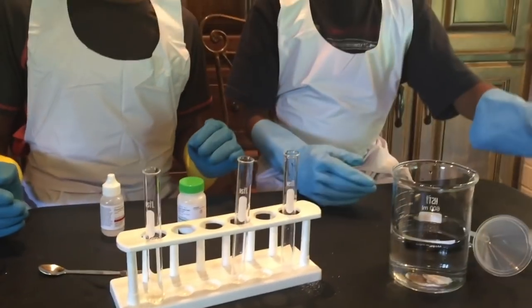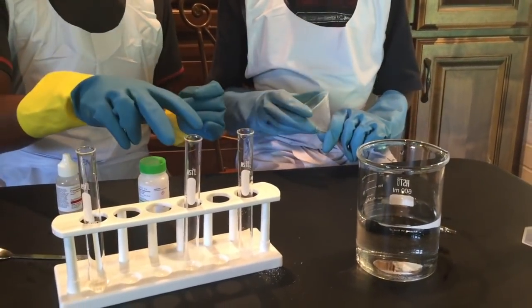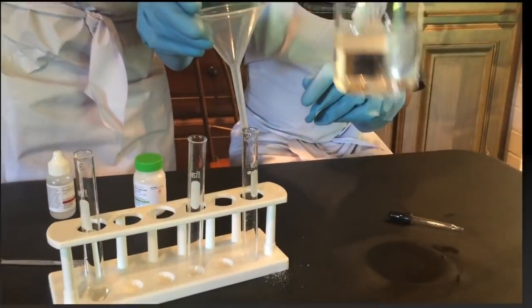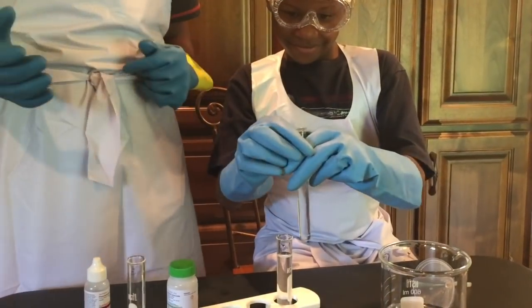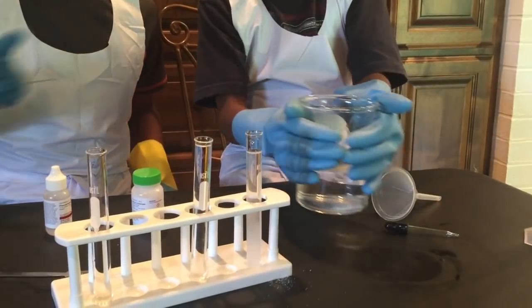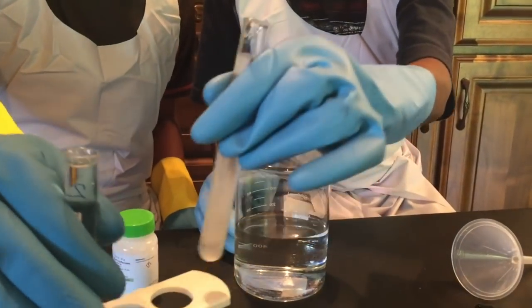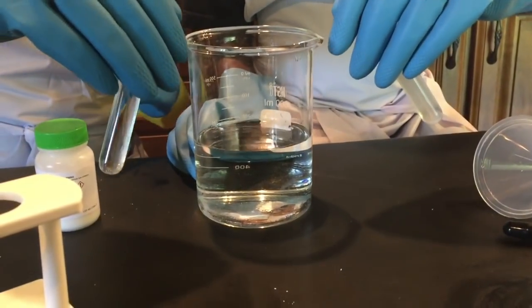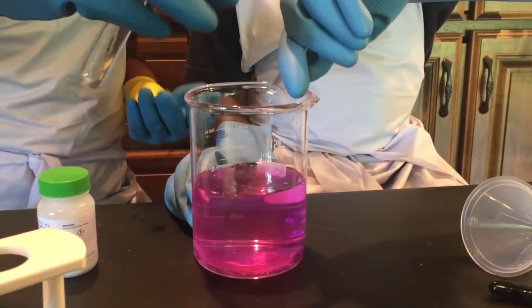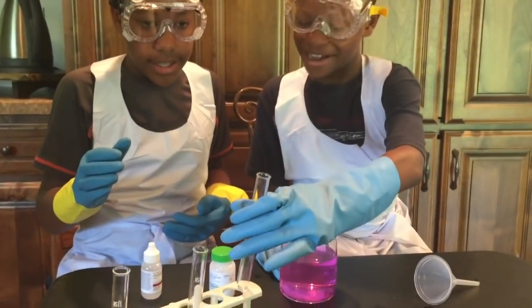Now we're going to take some water from the beaker and put it into our first and second test tubes. Now we're going to pour the contents of our first and second tubes into the beaker at the same time, and this will hopefully turn the water pink — it turned the water pink!